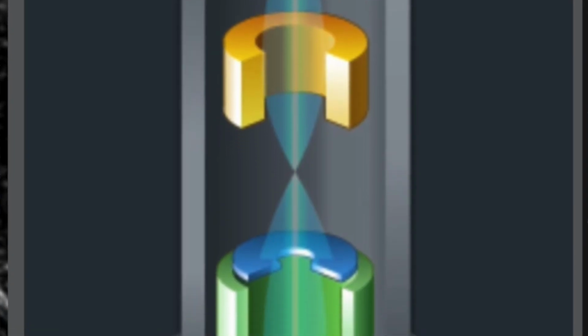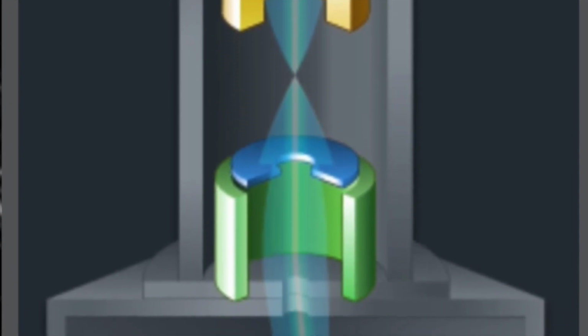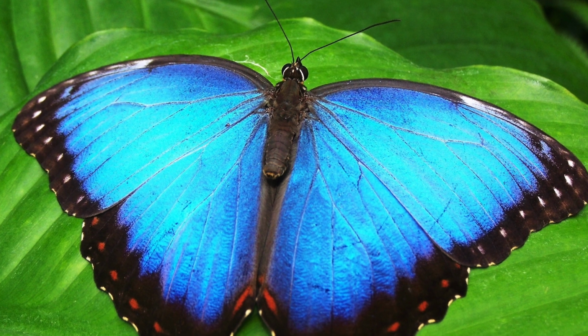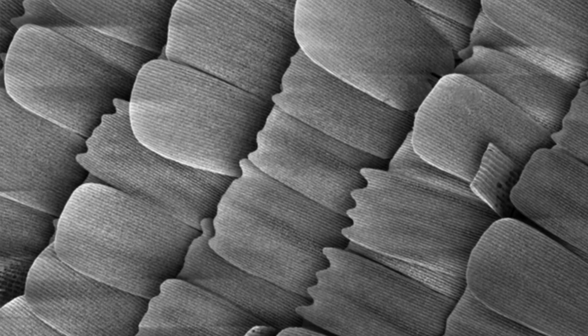In this regard, virtual microscope simulators are powerful tools to overcome these barriers. They have the ability to empower, enhance, and encourage learning, teaching, and training. These freely available resources will make both the students' and the teachers' lives a lot easier.